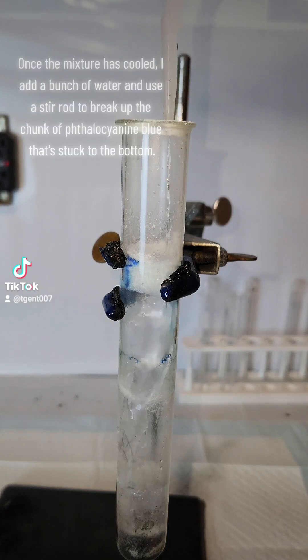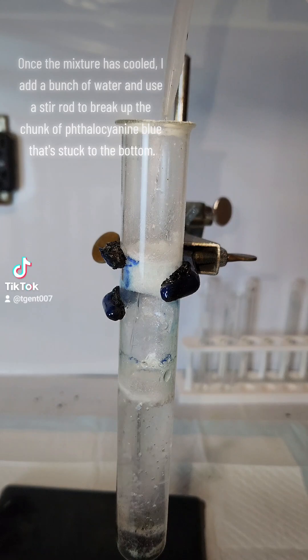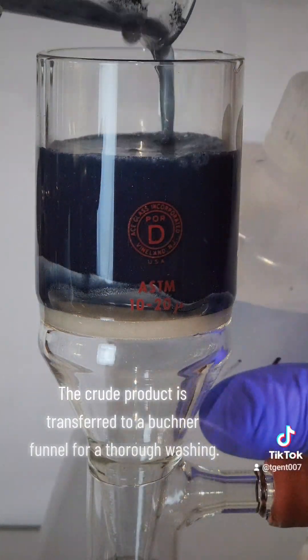Once the mixture has cooled, I add a bunch of water and use a stir rod to break up the chunk of phthalocyanine blue that's stuck to the bottom. The crude product is transferred to a Büchner funnel for a thorough washing.